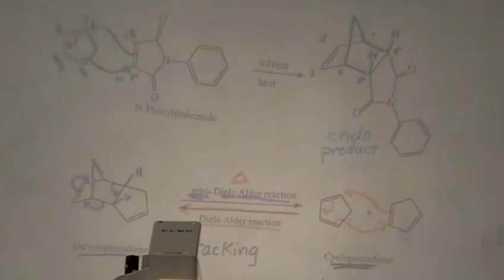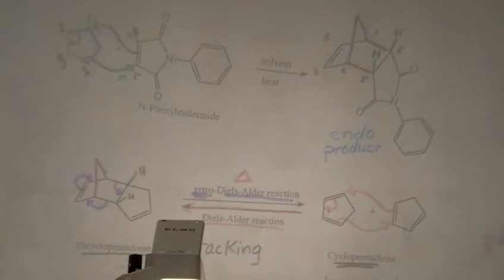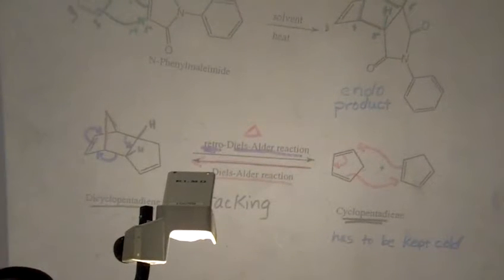Okay. Now, the trick to the reaction that we're doing this week is we need cyclopentadiene, and in order to get cyclopentadiene, you can't just have it laying around. We don't buy a bottle of cyclopentadiene. What we have to buy is dicyclopentadiene. So it sits around in a bottle as its dimer, okay?